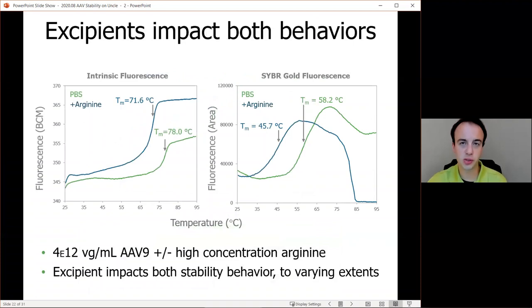We want to take a quick look at formulation impact on these behaviors. Here we have an experiment where we've started with an AAV9 in a PBS buffer. We've added a high concentration of arginine to really show the impact that formulation can have. On the left, we have intrinsic fluorescence data, which is telling us that our capsid proteins are unfolding in the presence of high concentrations of arginine, which is expected. However, on the right side of the slide, we see we have our Sypro Gold fluorescence data, we can see that the high concentration of arginine also decreases the stability by genome ejection, which is kind of unique in all the results. So that's how we can know that excipients can impact both stability behaviors of AAV capsids.